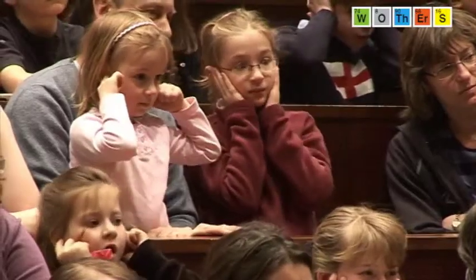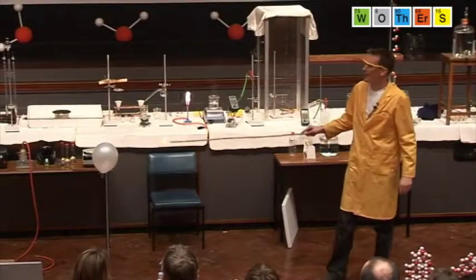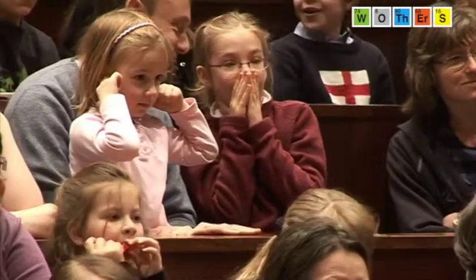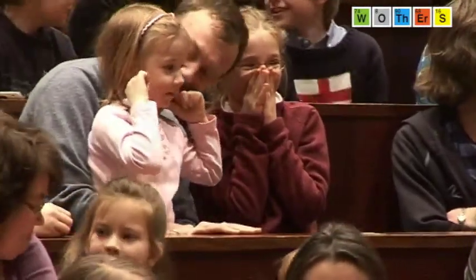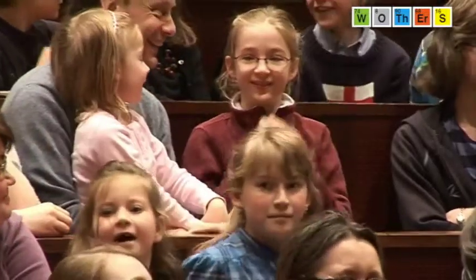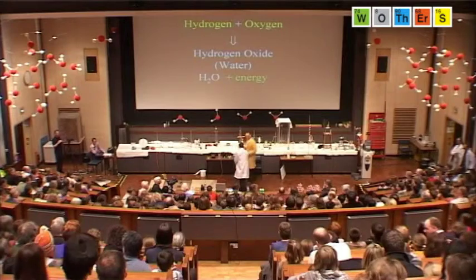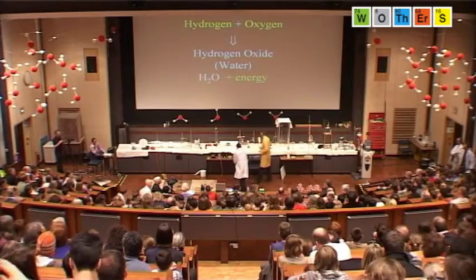Now, the hydrogen balloon was bigger. It was a bigger balloon. But see if this one's louder. Let's listen. Okay, you ready? Yeah, I thought that was slightly louder. So that one was equal amounts of hydrogen and oxygen.